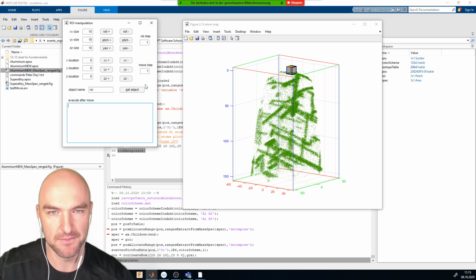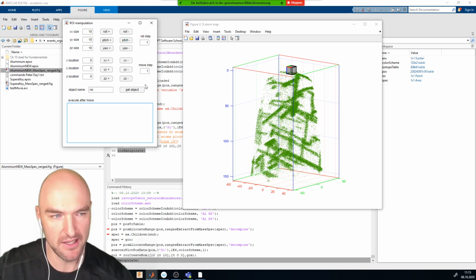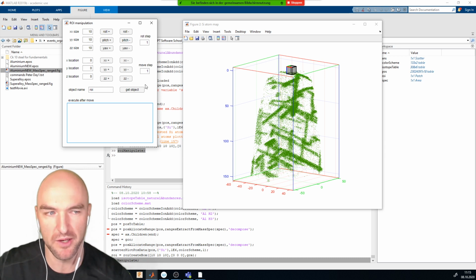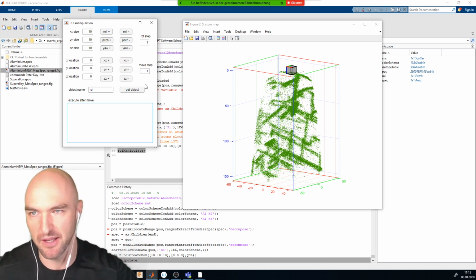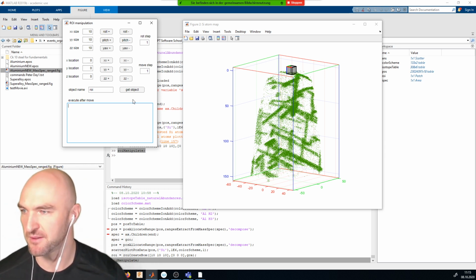And he will show us his user interface later today. What he has is very good spatial distribution maps code. So I think what I will do is I will steal some of Costa's code and use that so that he can also do that with spatial distribution maps.